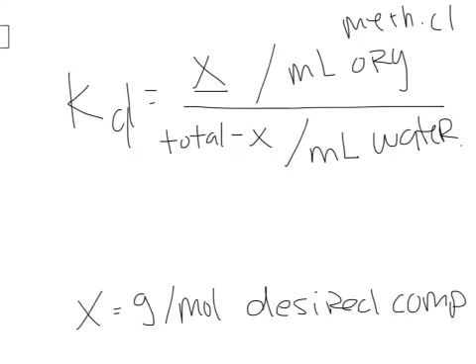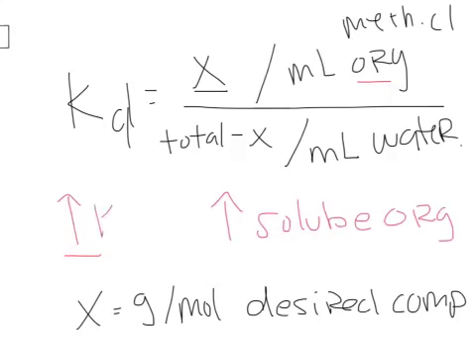If Kd is large, then the compound of interest favors or is more soluble in the organic layer. If Kd is small, it is more soluble in the aqueous layer. Its usefulness aids in determining which solution would be more effective in extracting a desired compound.